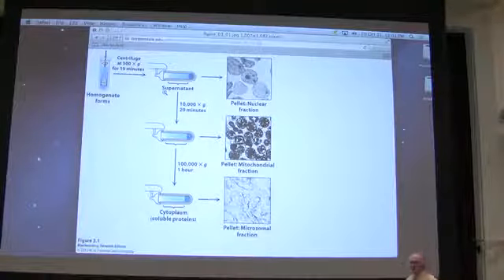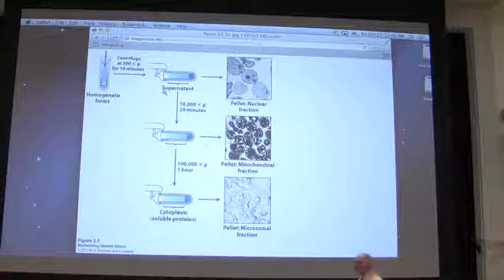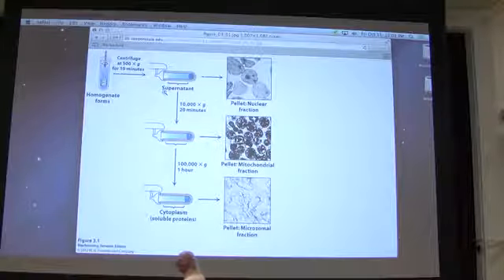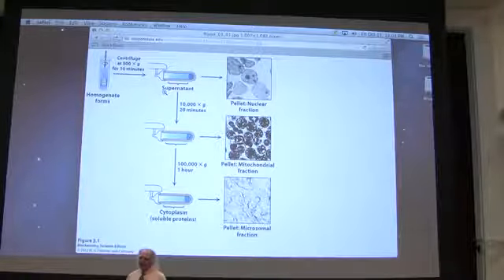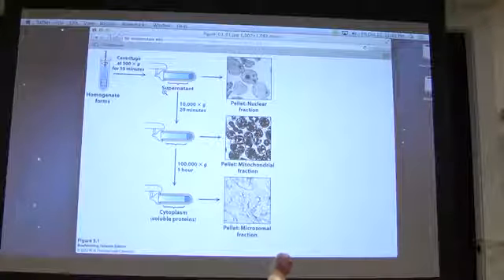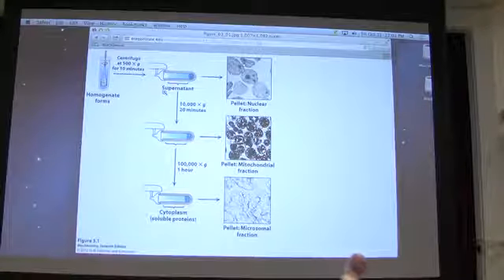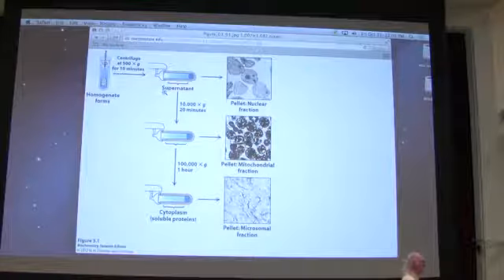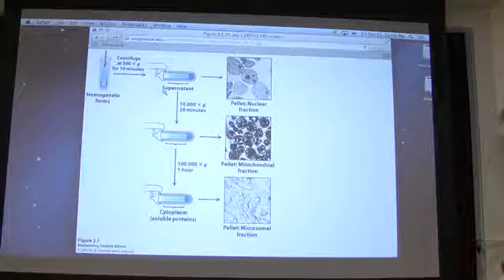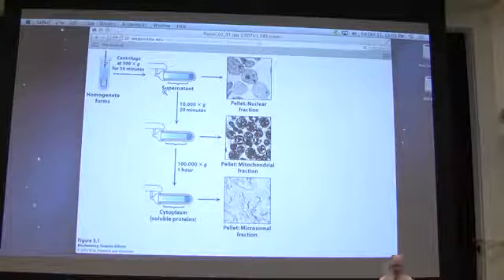And centrifugation turns out to be a really, really good way because these are very large complexes. And the way that we separate them is by what's called differential centrifugation. All right? So differential meaning that we use different rates of spinning the centrifuge, and those different rates of spinning will cause different things to go to the bottom of the tube. All right? So you can see here a depiction of some of those steps.